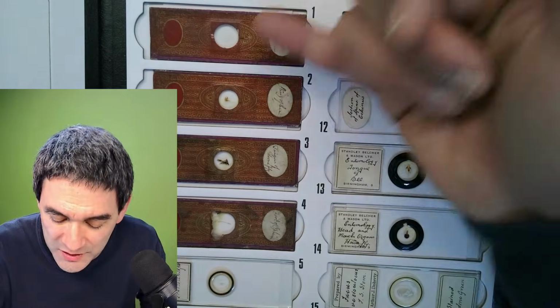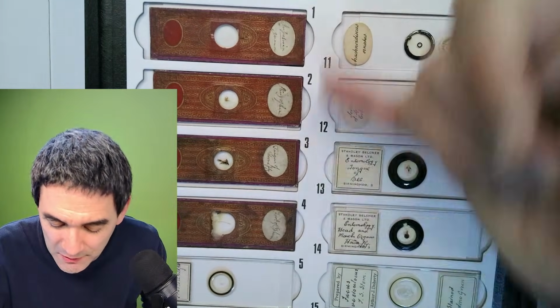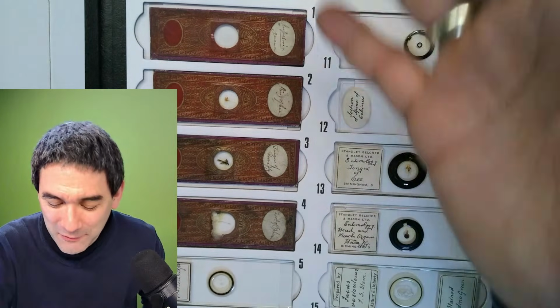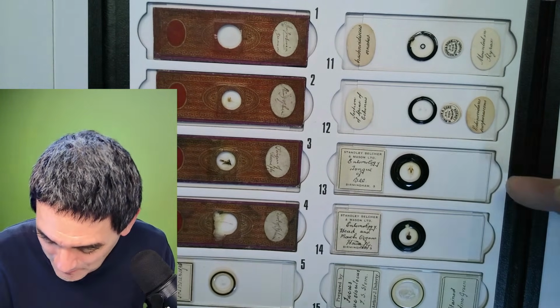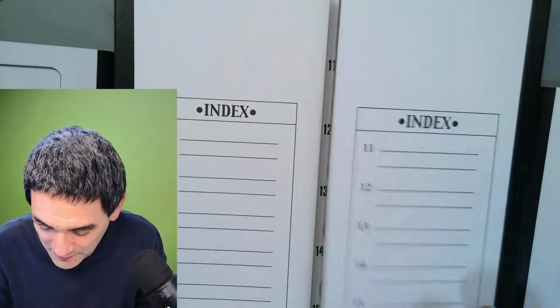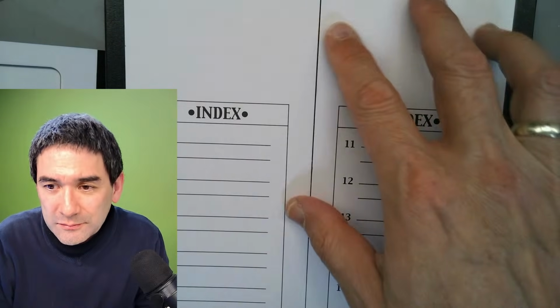Thank you for the information. If you're saying that, it could be that maybe they're laced with some kind of arsenic or whatever. Good to know. So let's have another look at a few others.